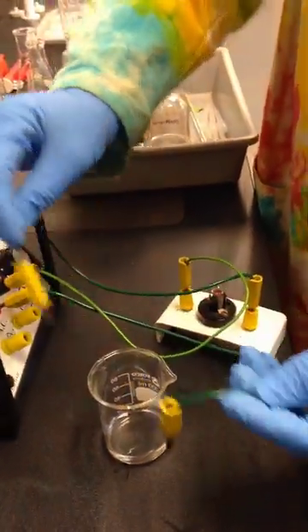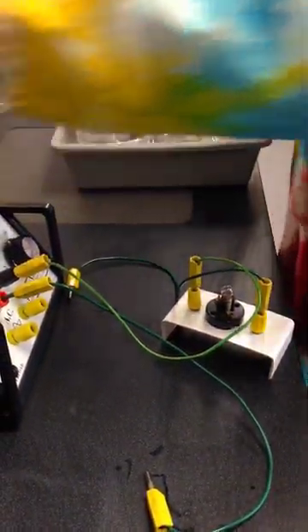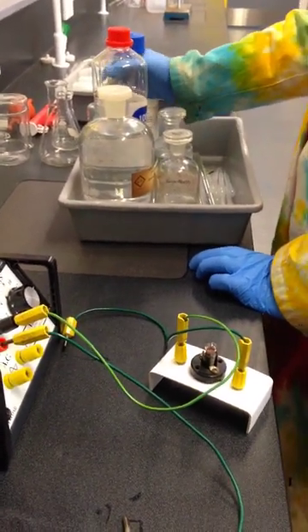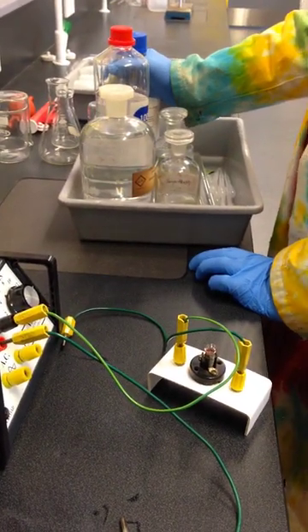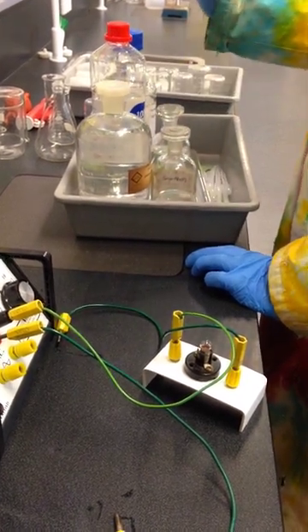If I'm not careful though, the plastic might dissolve. I'm not going to do the cyclohexane or the hexane because I just don't want the fumes going around the classroom at the moment. But it won't conduct.